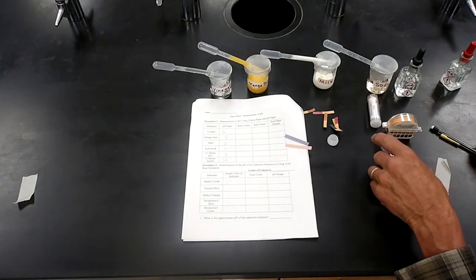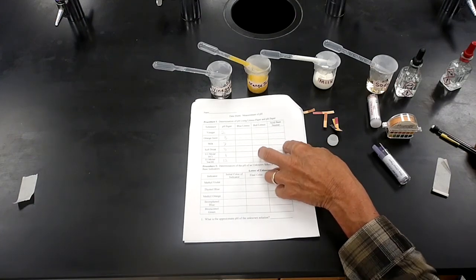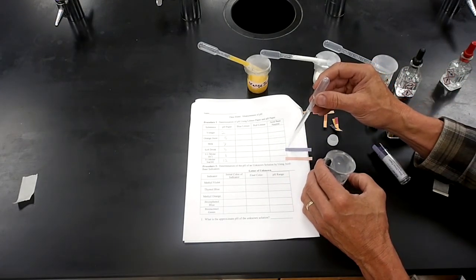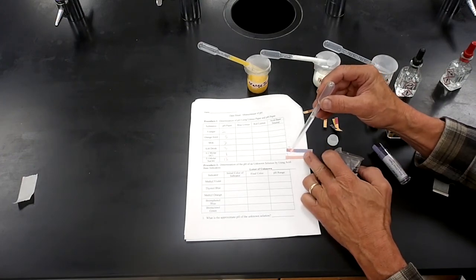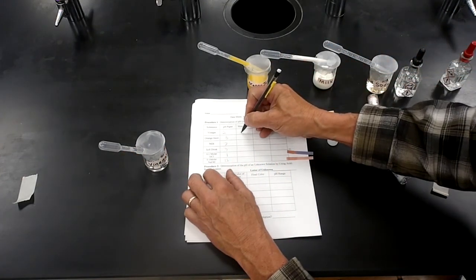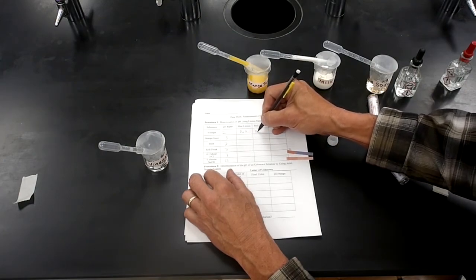All right. Then we'll do the litmus paper. So I have to use 2 bits. I'll go in the same order. I'll take vinegar, put a little bit on the blue litmus paper, a little bit on the red litmus paper, and they are both red. So all I can say for the blue litmus, it turned red. Red litmus, it stayed red.